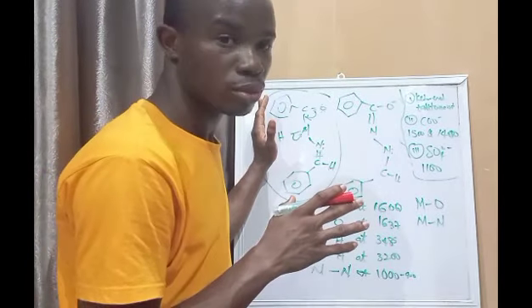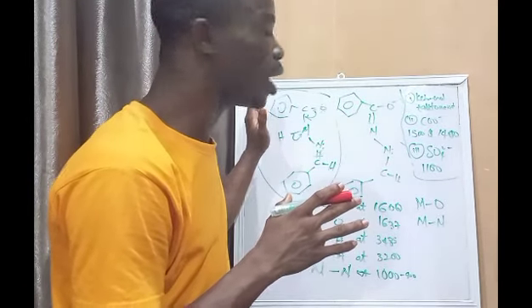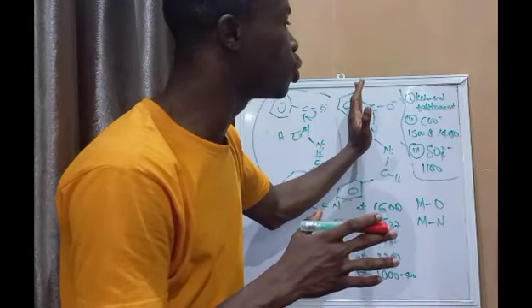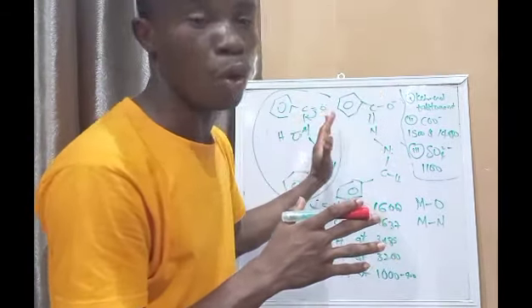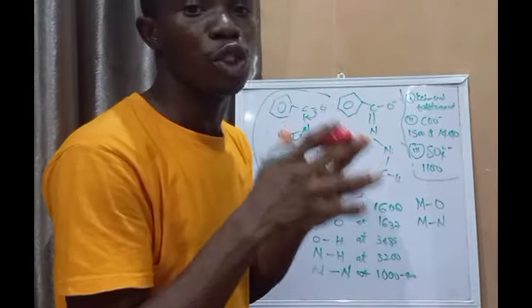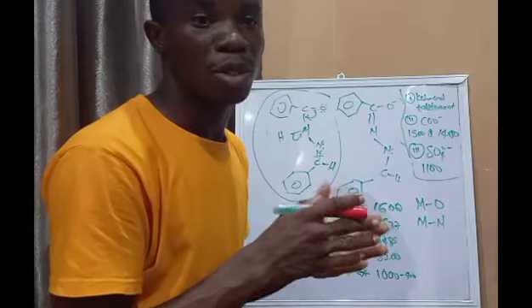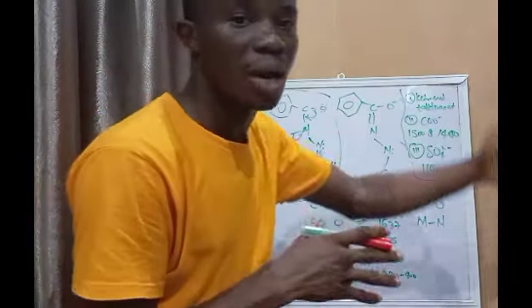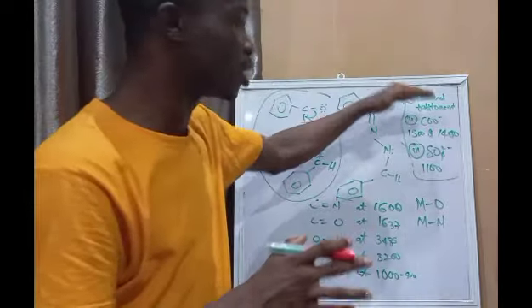But for hydrazones under certain conditions, this keto-enol tautomerism can occur, and that will also bring a difference between the IR spectrum of the ligand before coordination and after coordination. So let's take note of that.